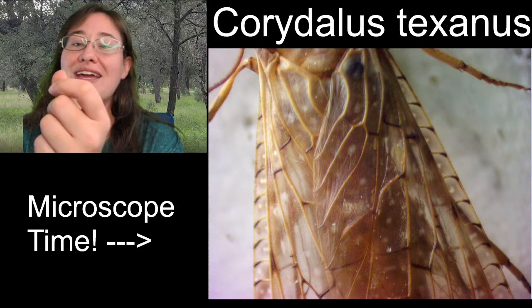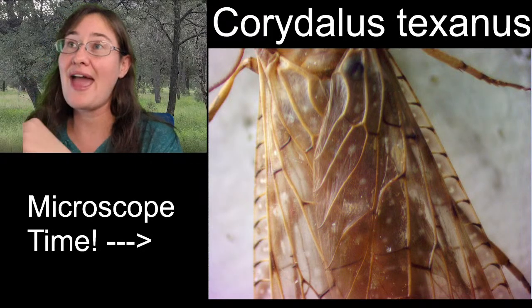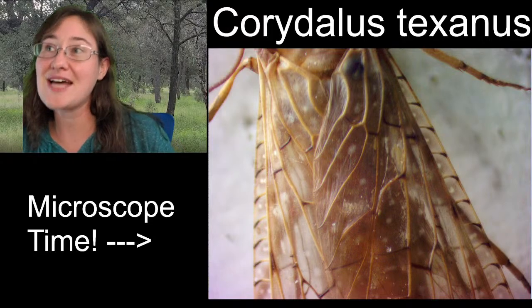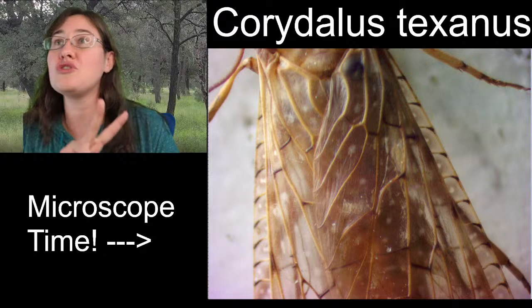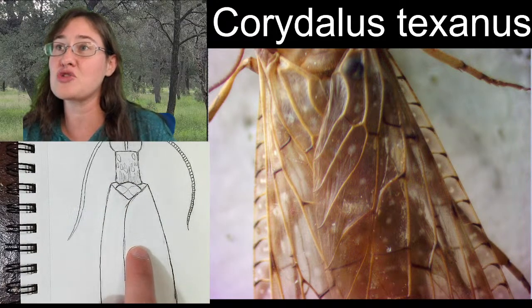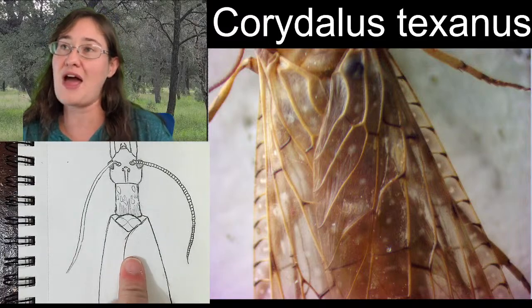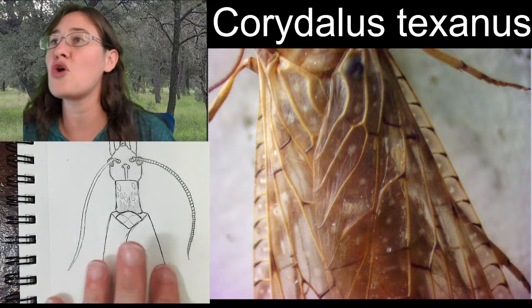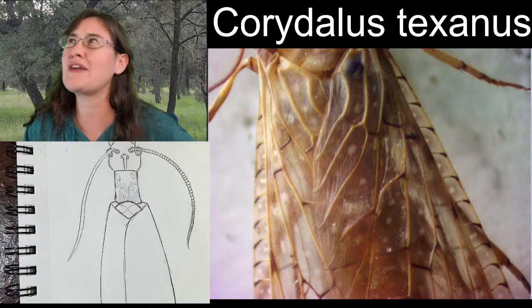Well, there is a species of fish fly that has straight antenna like a Dobsonfly, but it doesn't have those white spots in the cells. So between those two characteristics, where you have long straight antenna and those white spots in the cells, then you can say, I definitely have a Dobsonfly. If you just see these straight antenna and there are no white spots in the cell, it could be a spring fish fly.